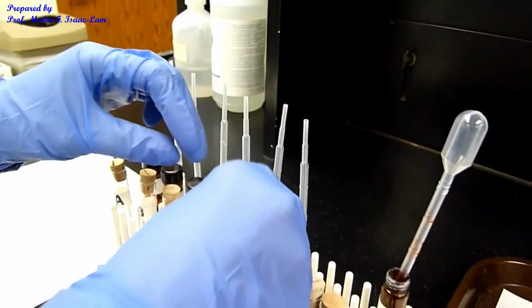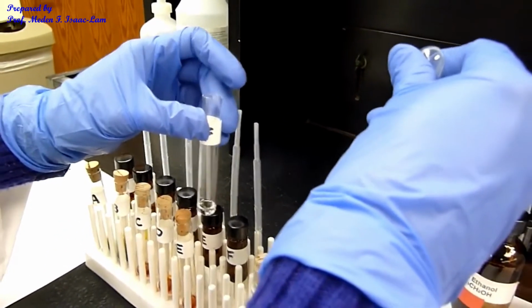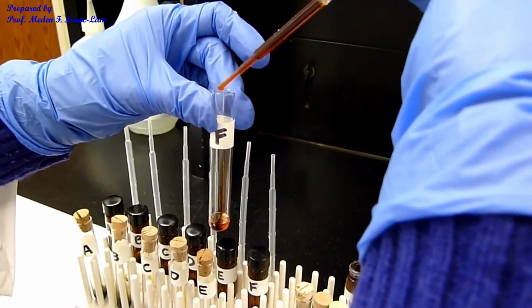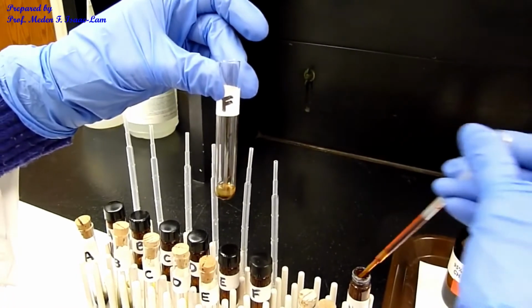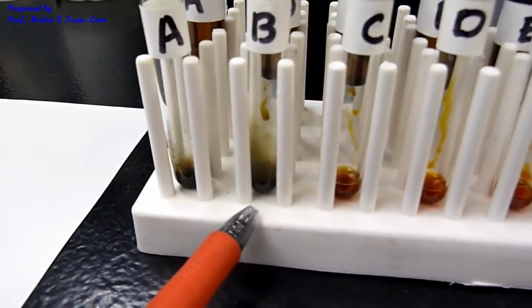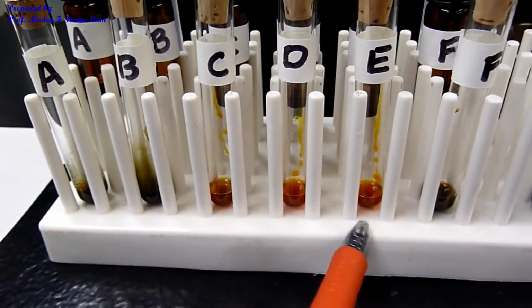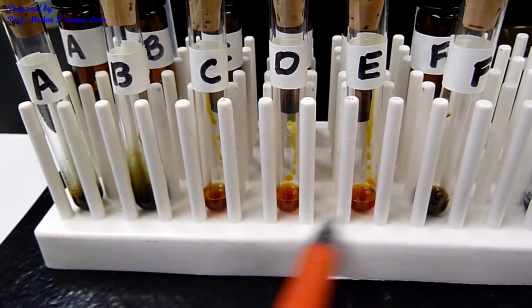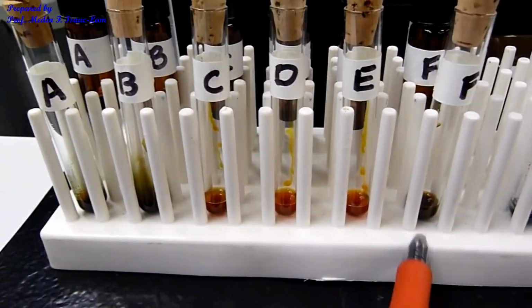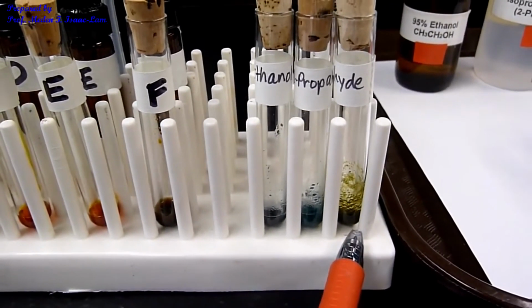And then last one is F. So 2 drops. So that's A, B, C, D, E. So A and B reacted, C, D, E, no. F reacted. It's not as intensely green as A and B, but it reacted. So again, these are standard ethanol, 2-propanol, and then anisaldehyde.